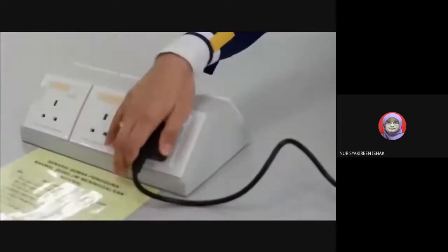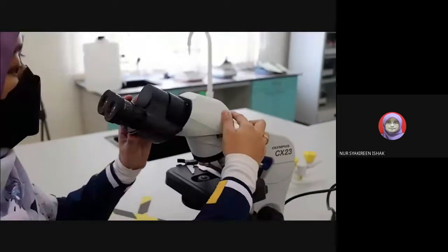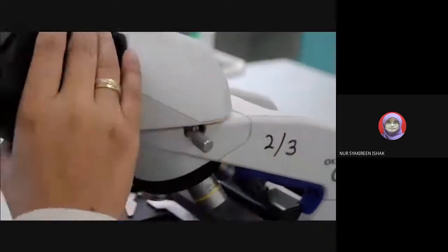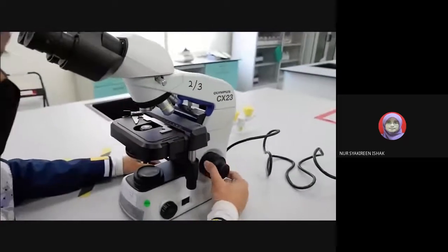If you need to get the microscope, be sure to hold it right. Unwind the electrical cable and turn on the electrical power of the microscope. Unscrew the ocular lens and remember to adjust it to the placement of your eyes. Switch on the microscope and remember, do not use the fine focus knob. Use the coarse knob to adjust the stage so that the stage is at the highest position.